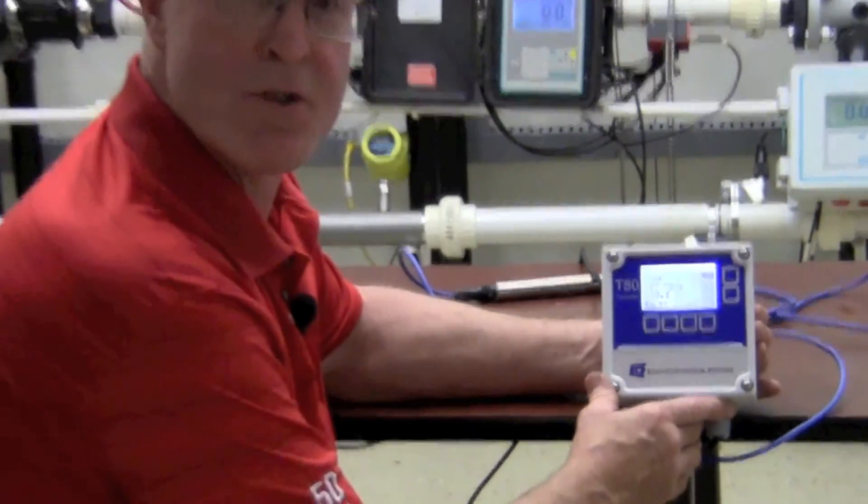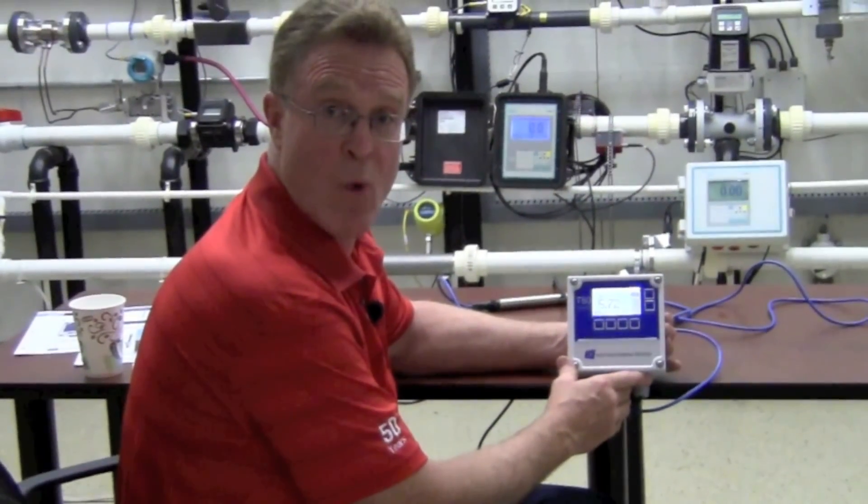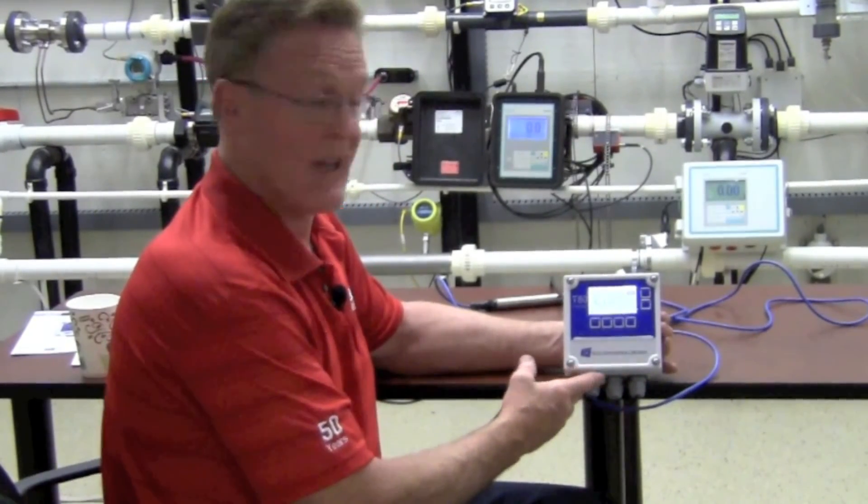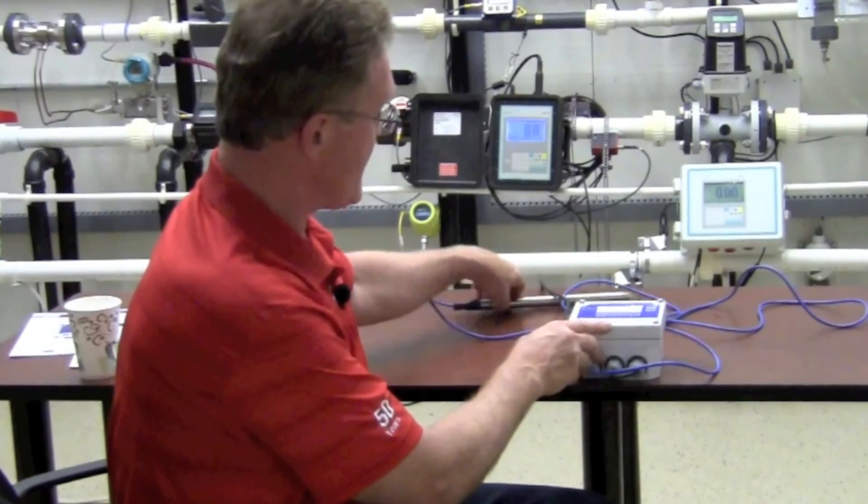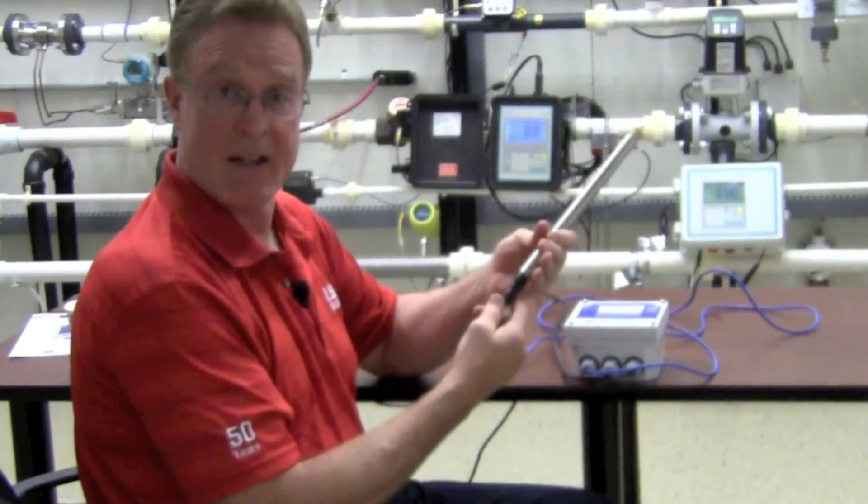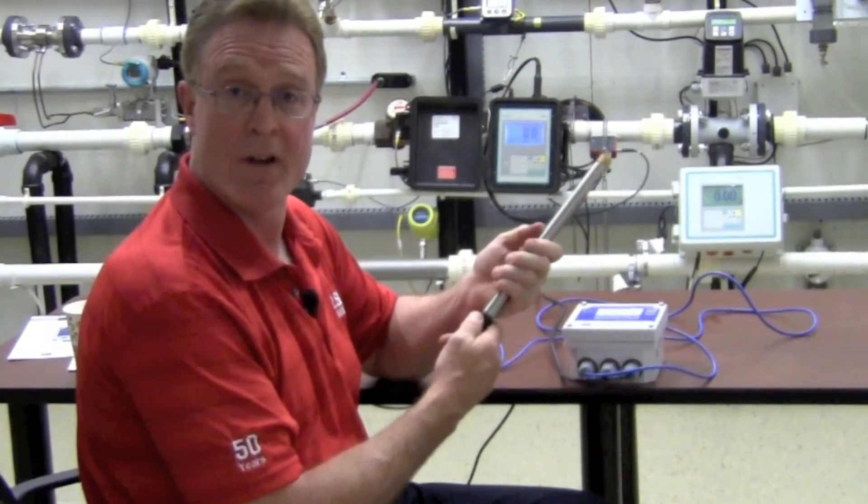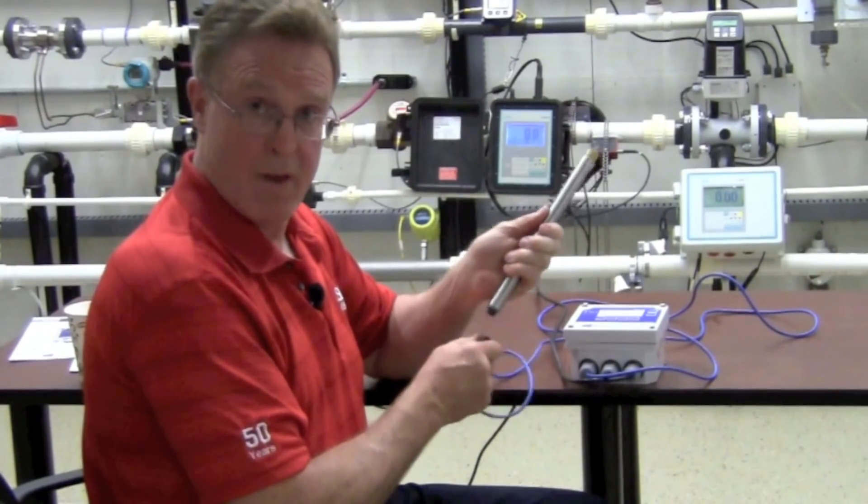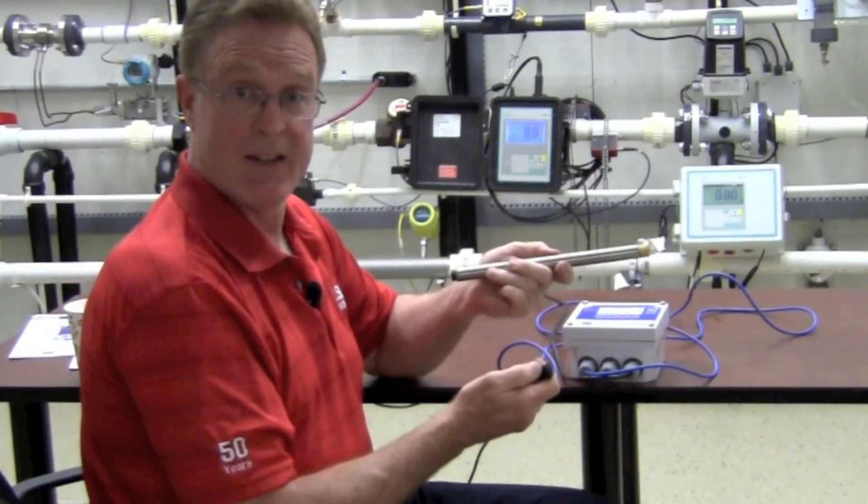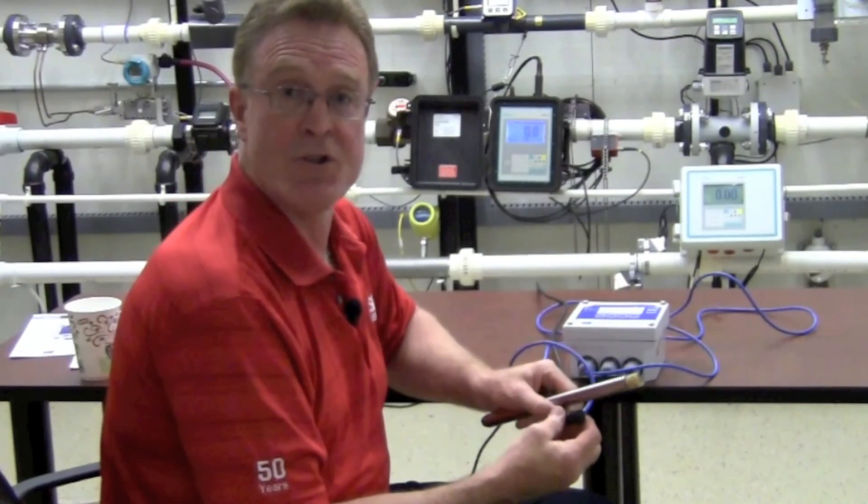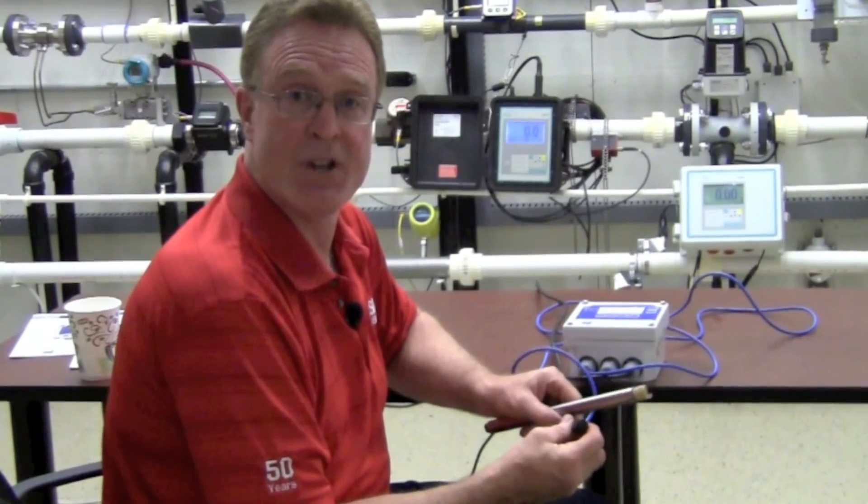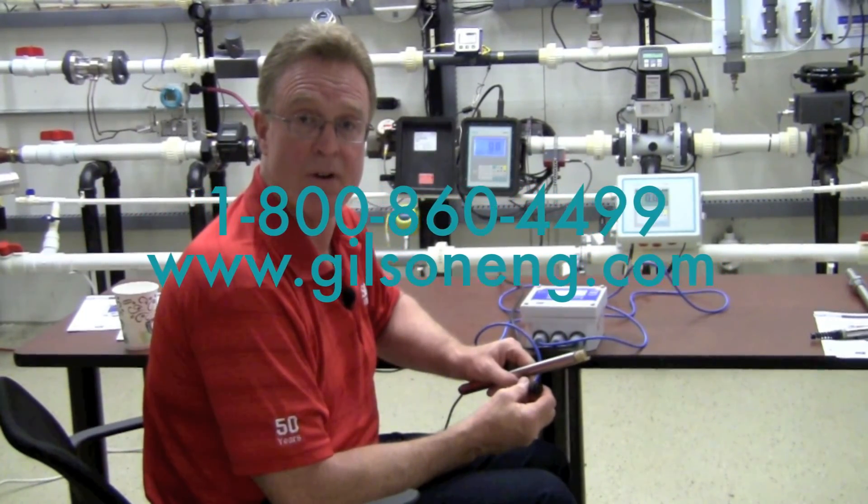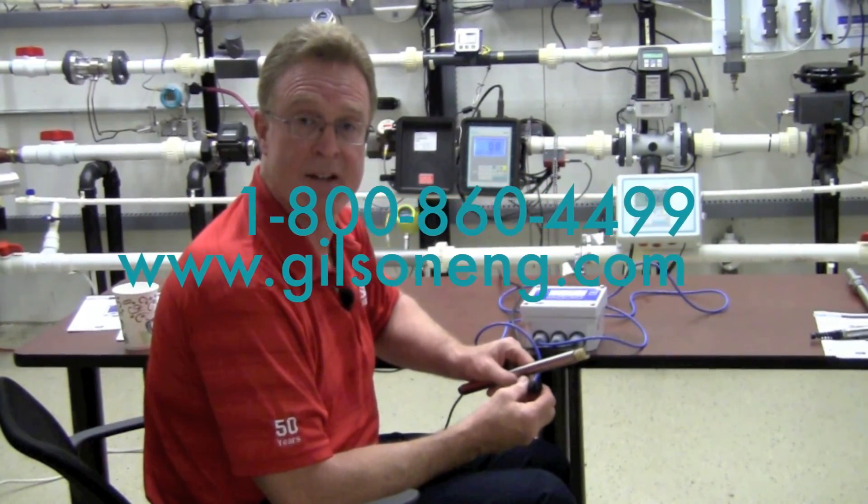While the S80 sensors are available in a wired unit, the capability of automatic calibration, as I've shown you, in conjunction with the quick disconnect on the back end, either a straight or right angled, makes it a true winner and makes it easy for you to utilize in the field with the ability to do your calibrations back in the lab. For additional information on the S80 and T80, please contact your local Gilson office at 1-800-860-4499. Thank you.